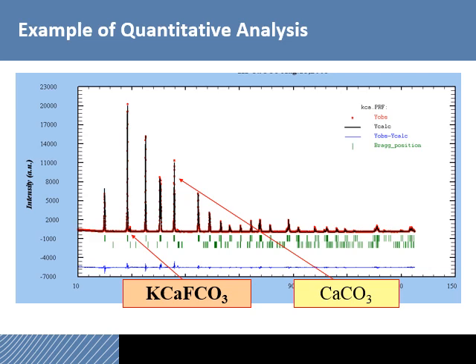So here is an example of a quantitative analysis. This is actually from the old set of slides. So this was actually done in FullProf or GSAS. I don't really recall, I haven't used them in a lot of years, but at least it demonstrates what a Rietveld refinement sort of looks like.